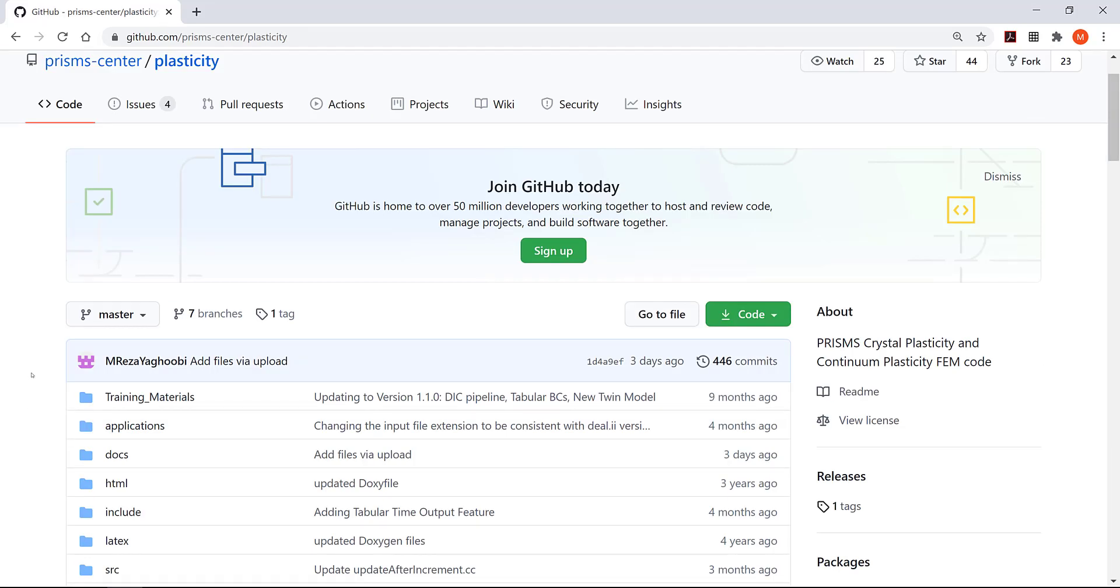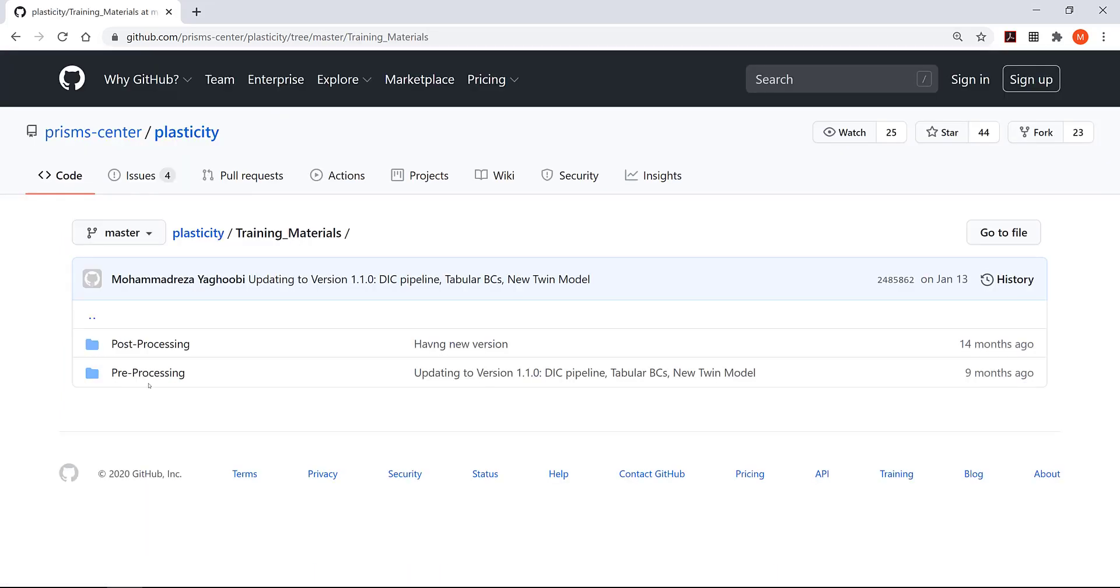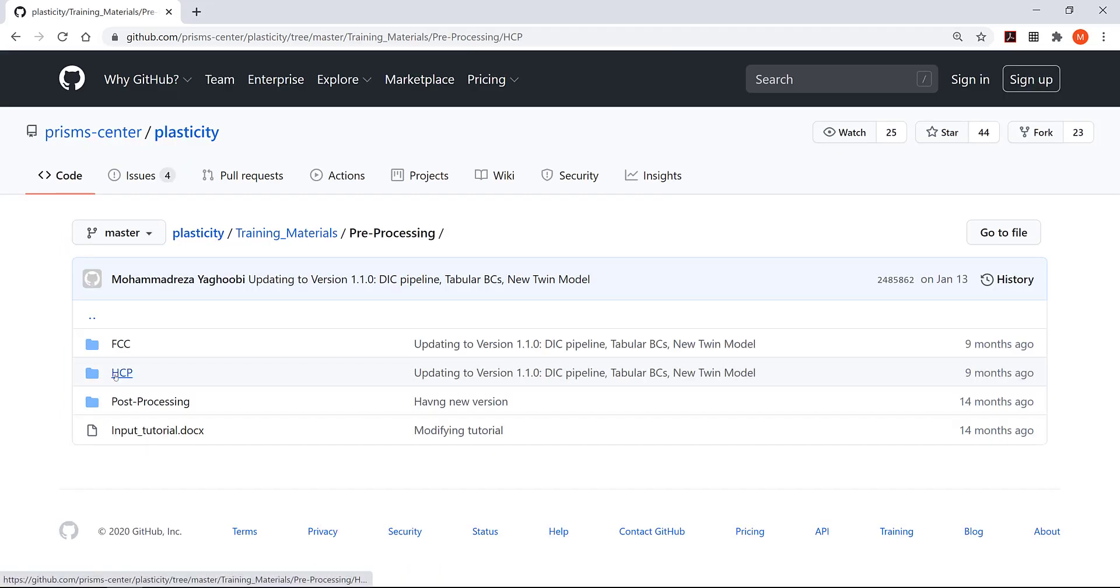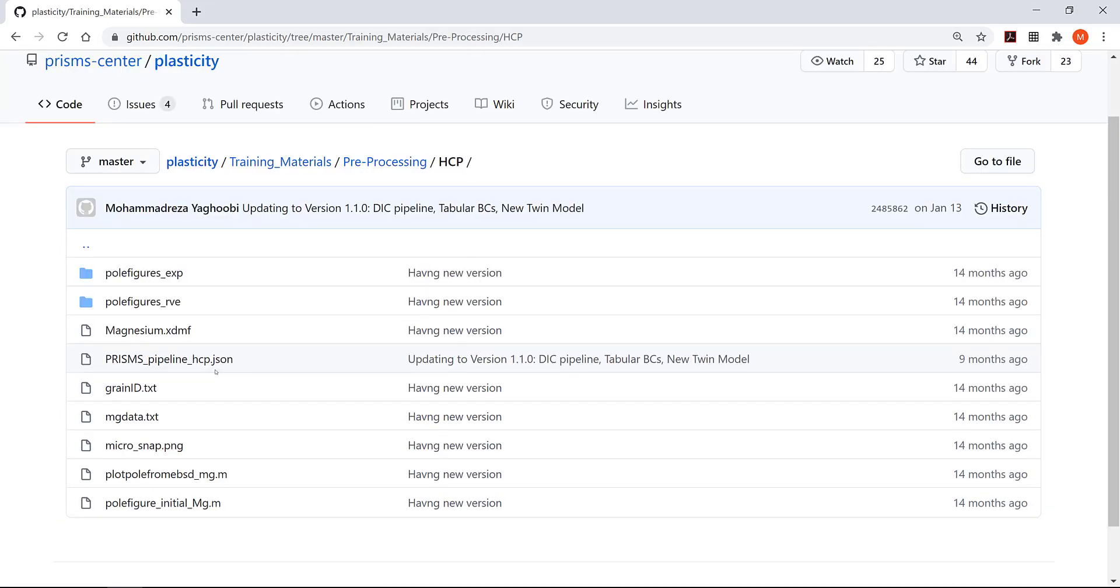If you go to the training materials and then to the pre-processing HCP folder, there is a file here called 'prisms_pipeline_HCP.json'. This file is actually the pipeline we prepared for the DREAM.3D package so you can post-process your EBSD data and generate the input microstructures for your PRISMS Plasticity simulation.